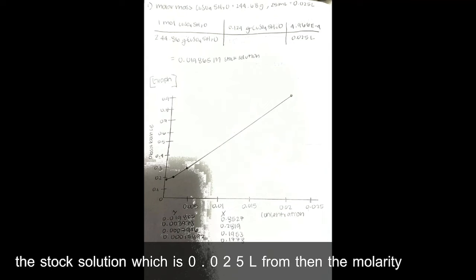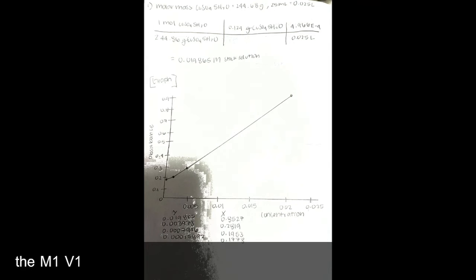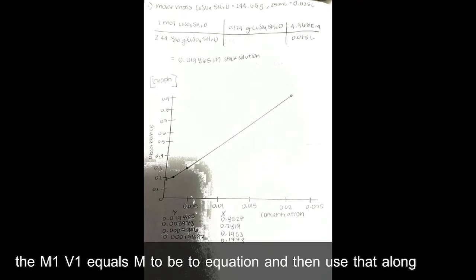From the molarity, we used the M1V1 = M2V2 equation, along with the molarity of the stock solution, to get the molarity of the dilutions.